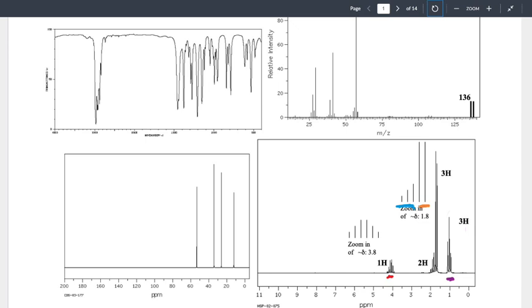So when you're looking at the digital spectra, which is the most common thing that you'll look at, you should try and find some other way to visualize it other than looking for those tiny little pinprick black points. What you can look for instead is the white space in between those pinpricks. If you only have 1 peak, there's no white space in between. If you have 2 peaks, there's 1 white space. 3 peaks gets you 2 white spaces.